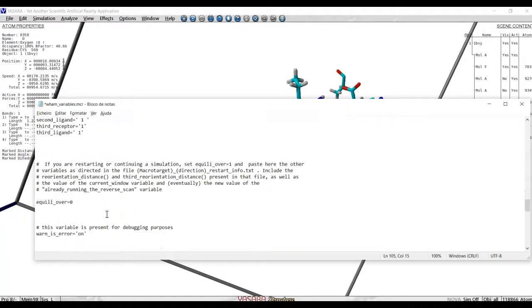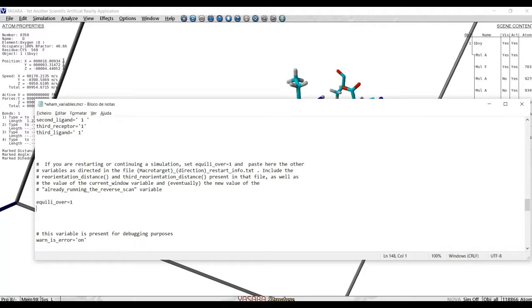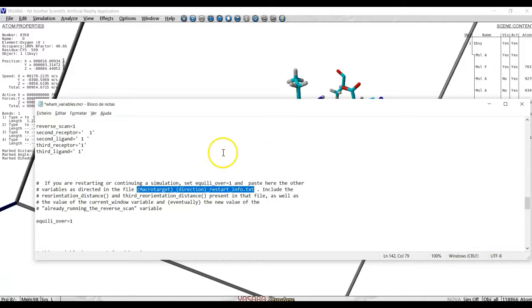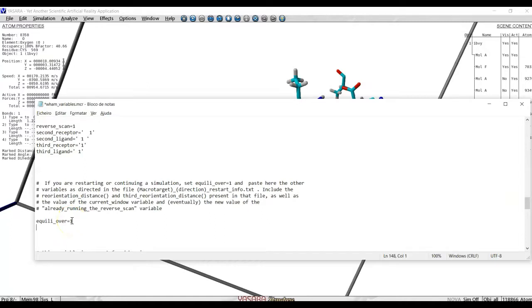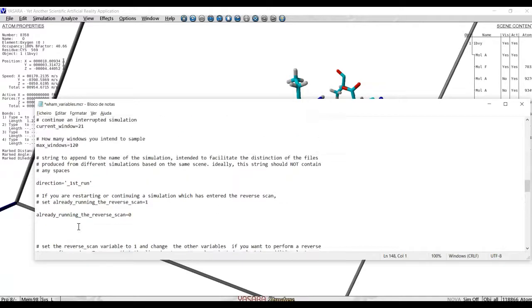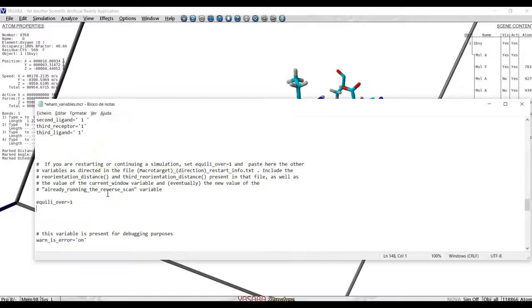And then, here, at equally over, we set it to 1. We only set equally over equal to 1 when we are restarting or continuing the simulation. And when we do it, we should also, here, add several lines with parameters. Those are lines which include the reorientation distances and the like. And you do not write them from scratch. Every time the program is running, every time it finishes a window, it outputs a file called macro-target-direction-restart-info. At the end of that file, you will get a snippet of two or three lines, which must be pasted here, with equally over equal to 1, when we want to restart. If you do it, you always have to remember to change the current window to the number which you are interested in.